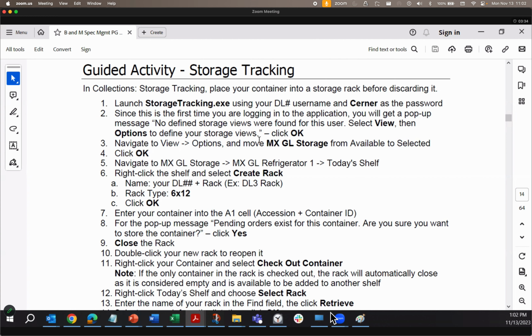And then we marked that collection as missed, recollect. We then collected that specimen at the remote draw login location. We placed a stat bicarbonate level order, and then we used collections resolution to merge that uncollected order into the already collected container. And we could do that because they had matching collection requirements.